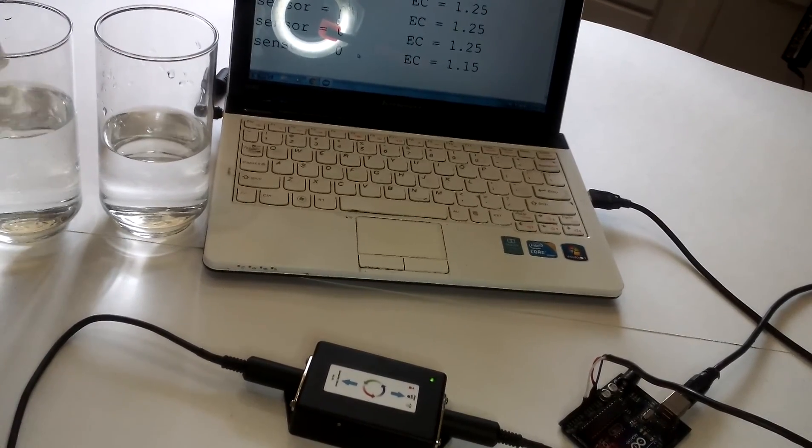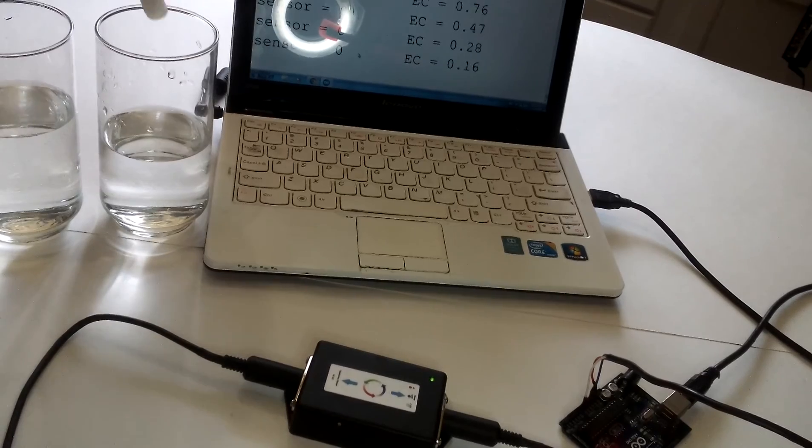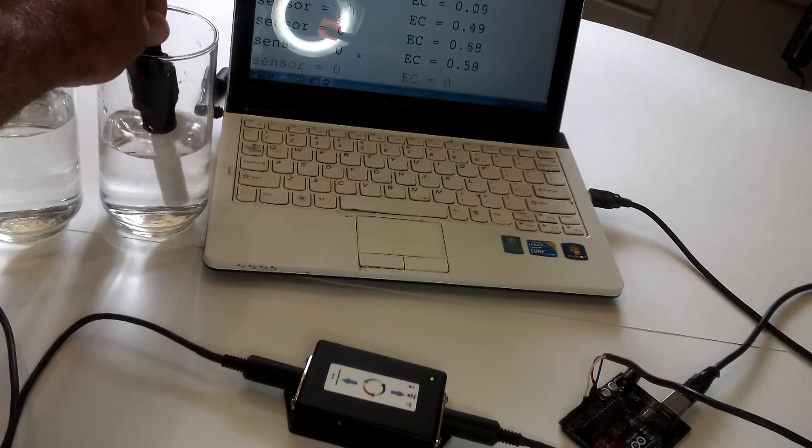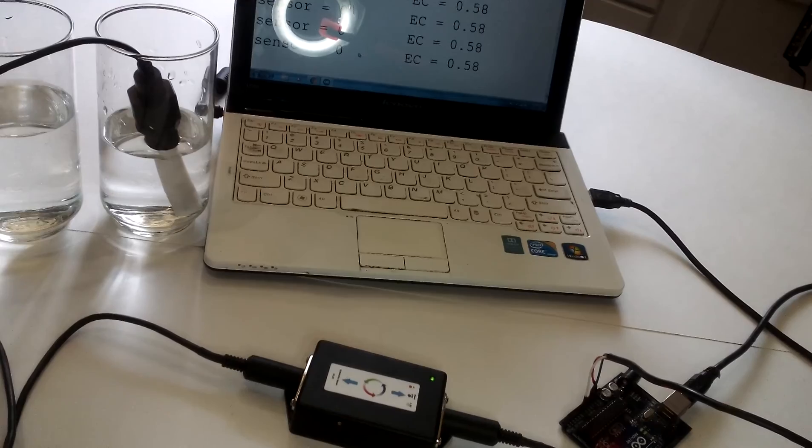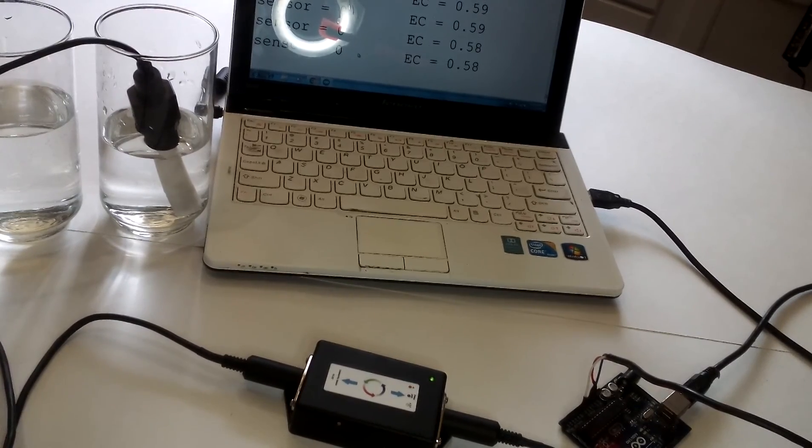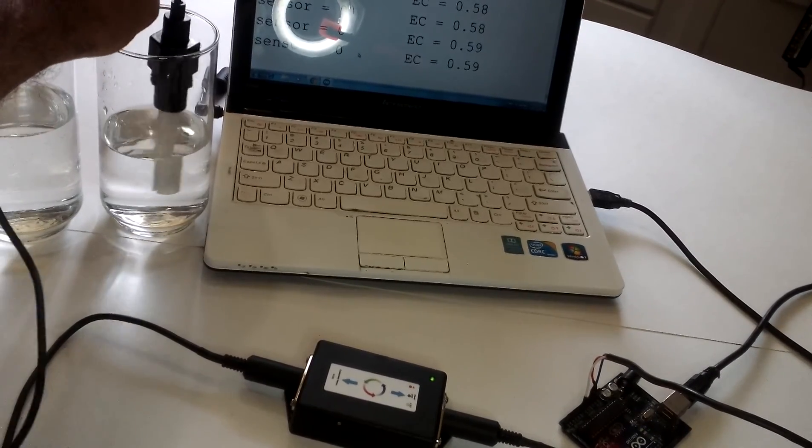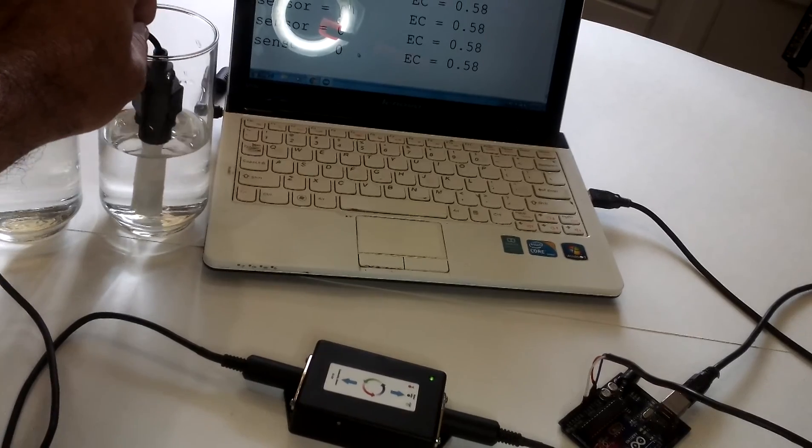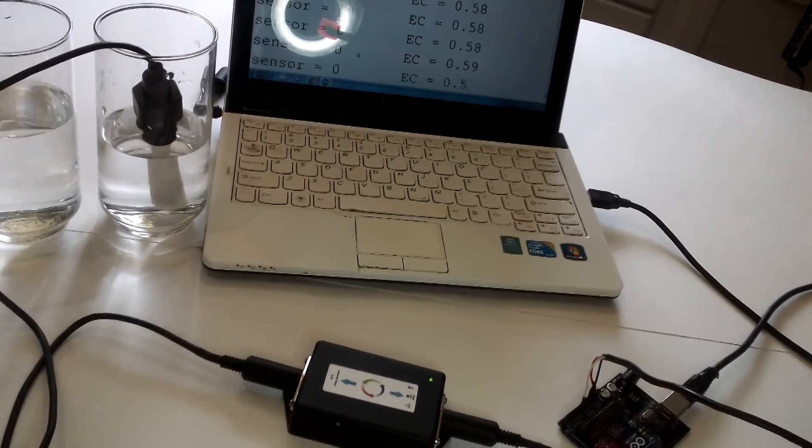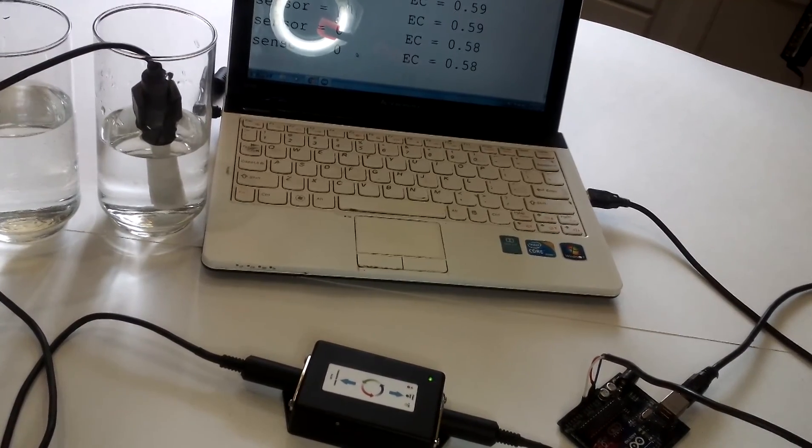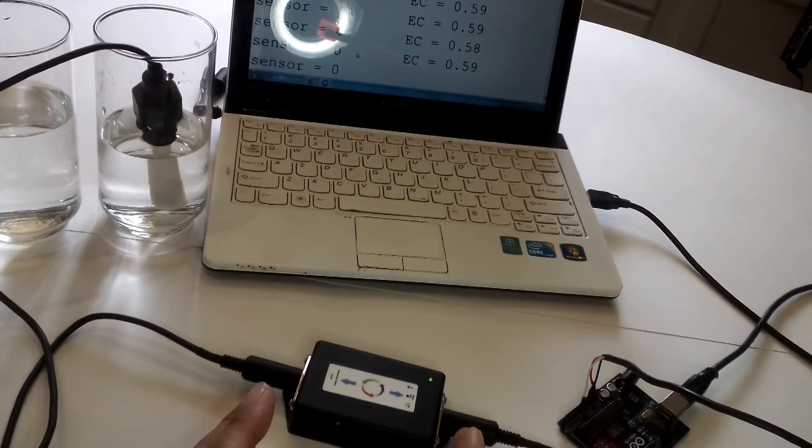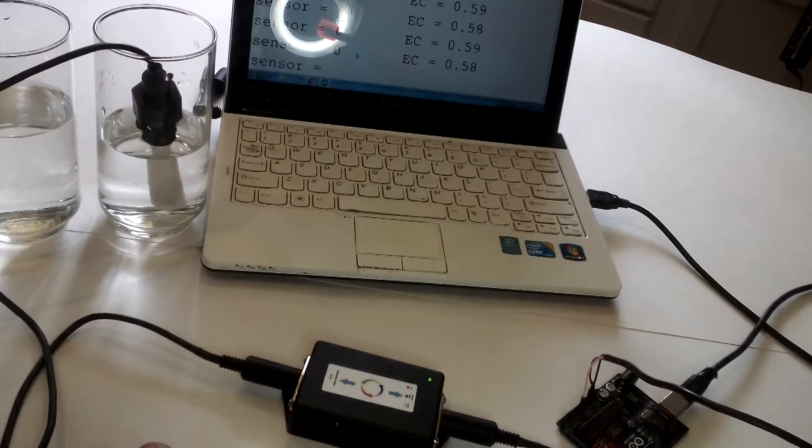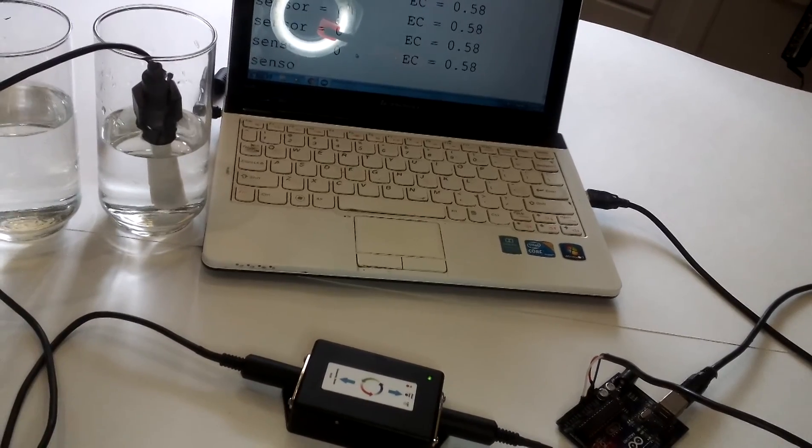Now let's go back to our tap water. It's reading about 59, so 590. And this unit has error of 2% from the full scale, which is pretty good actually.